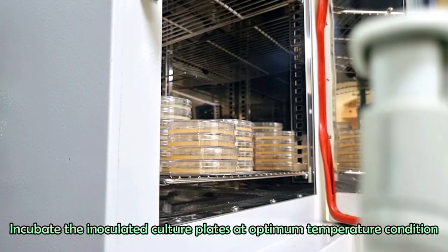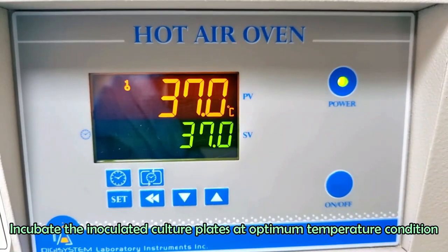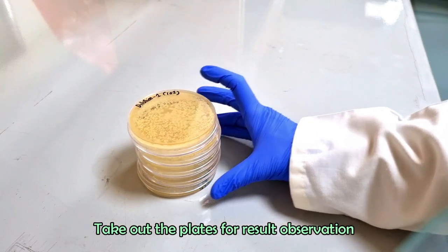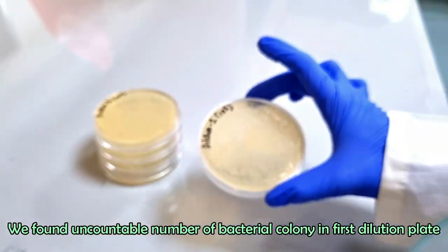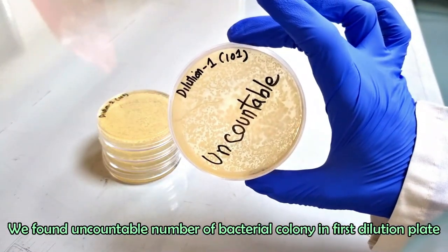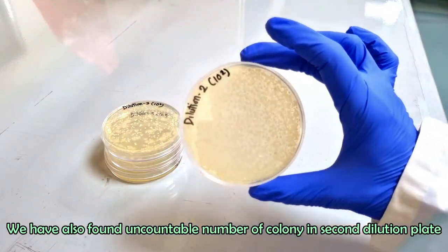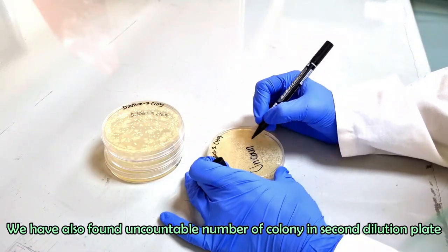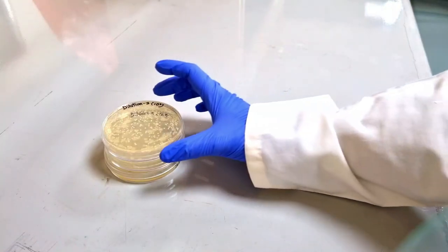Incubate the inoculated culture plates at optimum temperature condition. After the incubation period, take out the plates for result observation. We found uncountable number of bacterial colonies in first and second dilution, because colony density is so high in the first and second dilution samples.